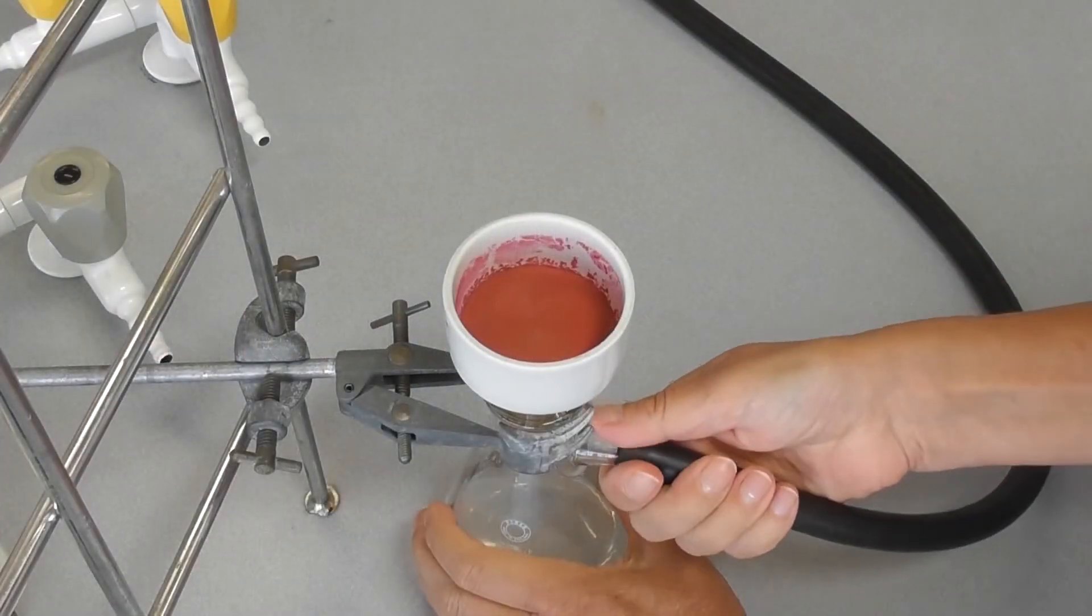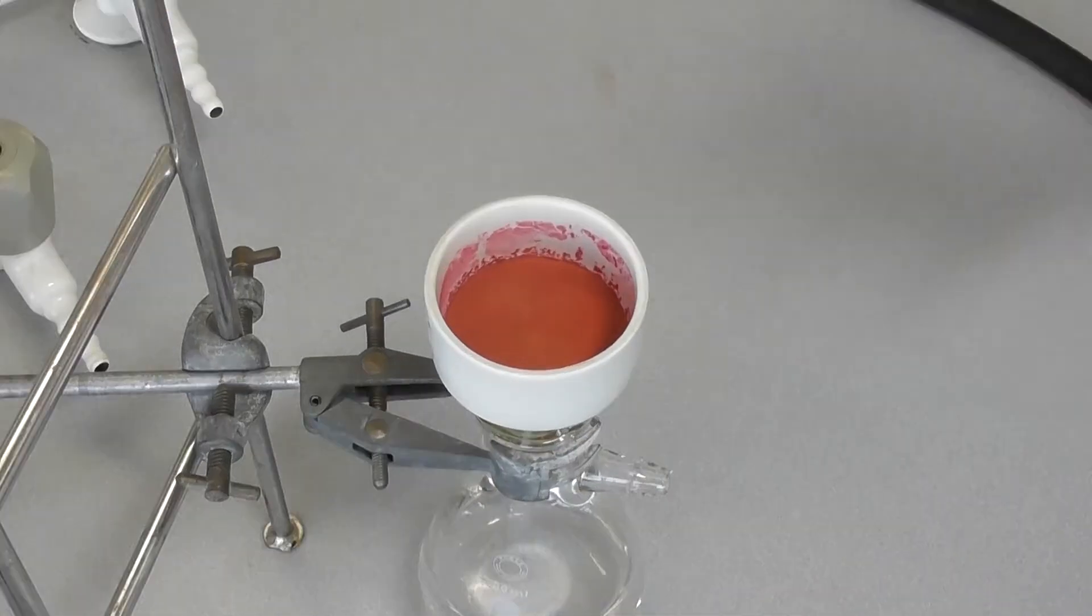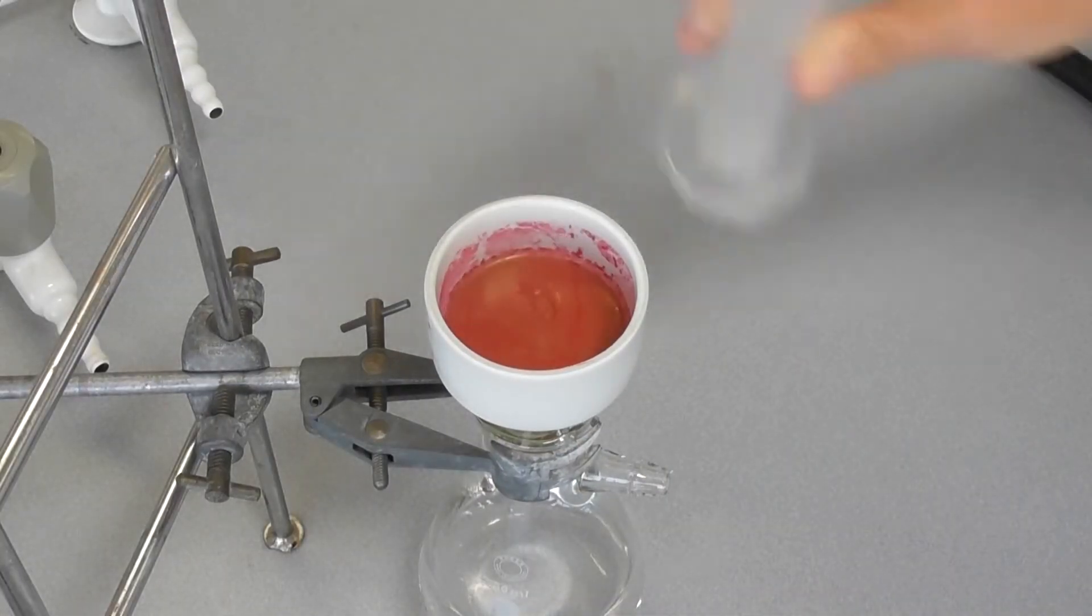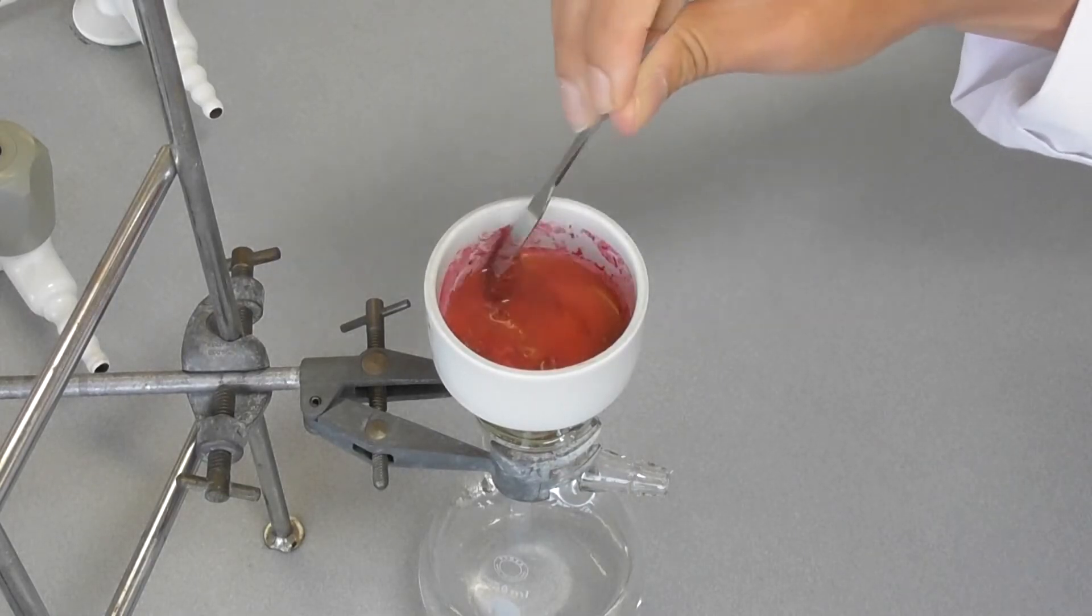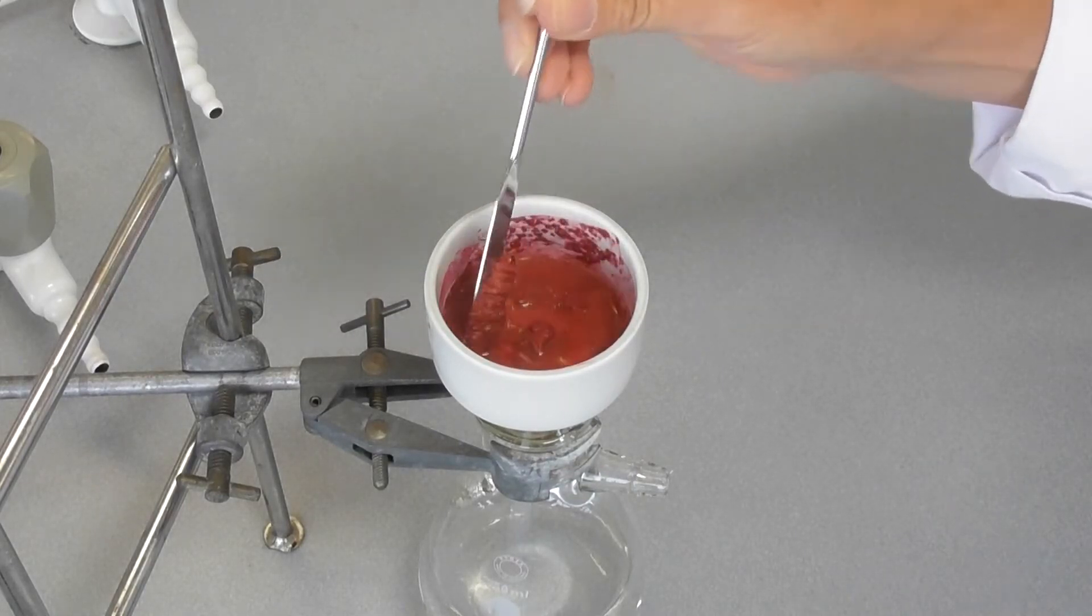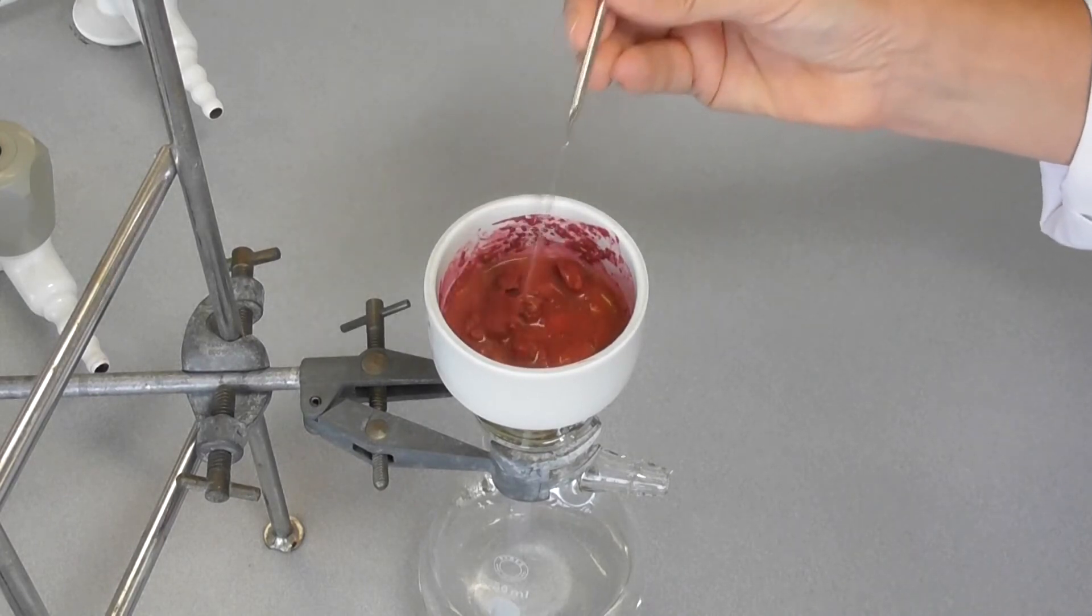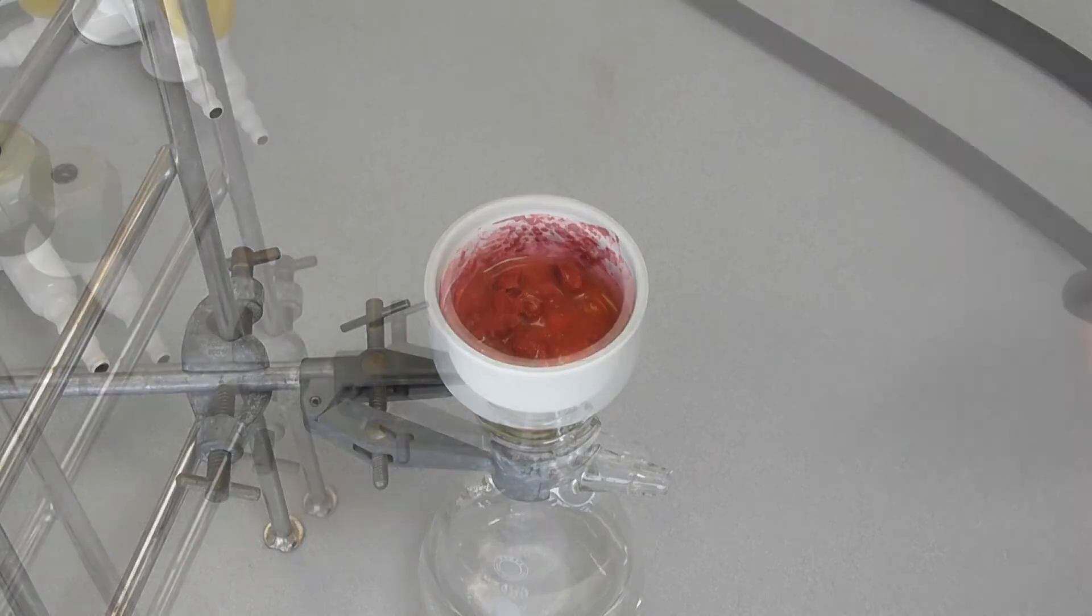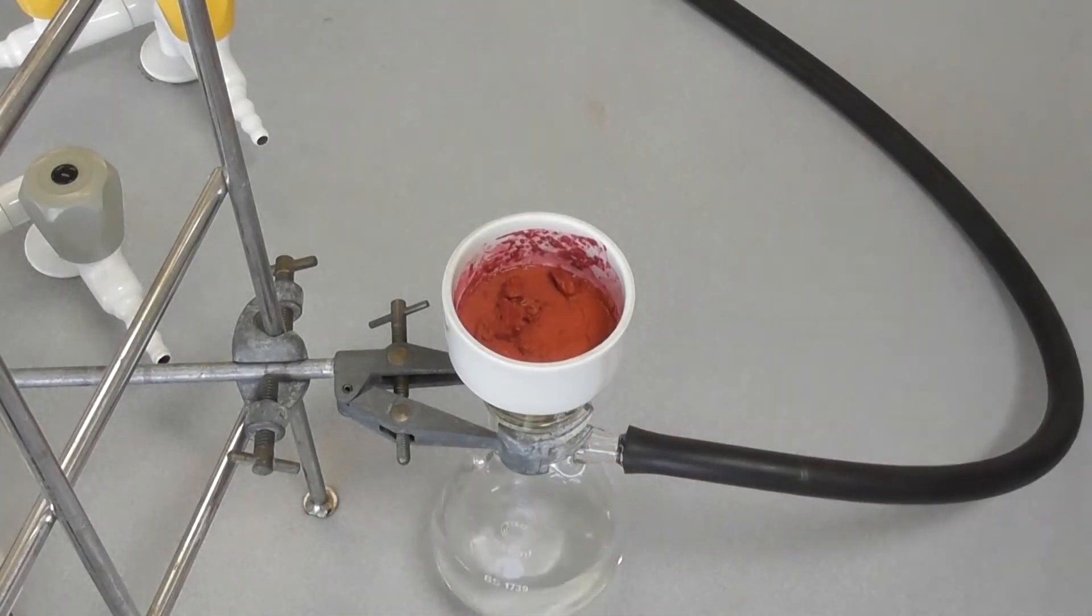Remove the vacuum hose. Add your washing liquid to the funnel and mix the product with the liquid. Reapply the vacuum to the Büchner flask and smooth out the solid in the funnel.